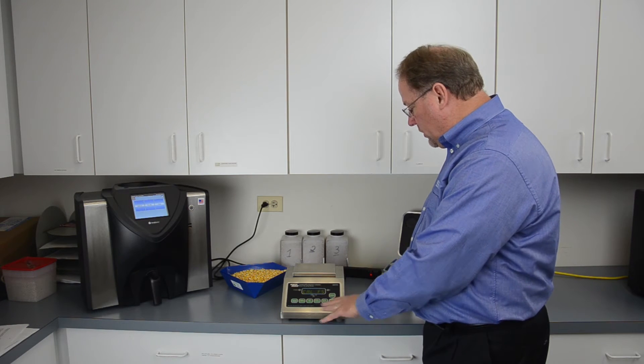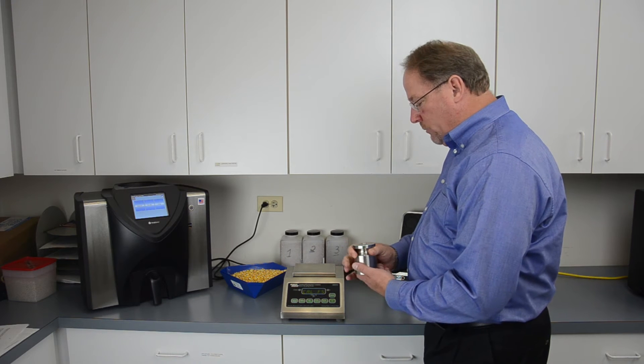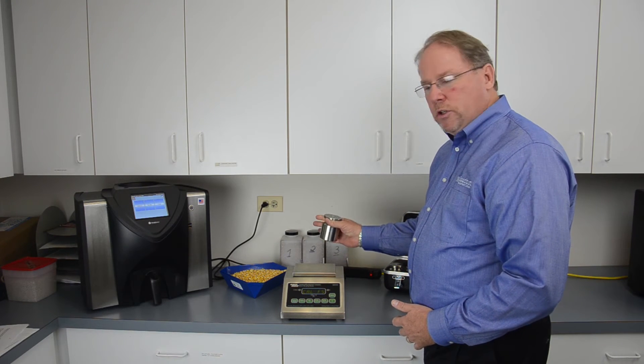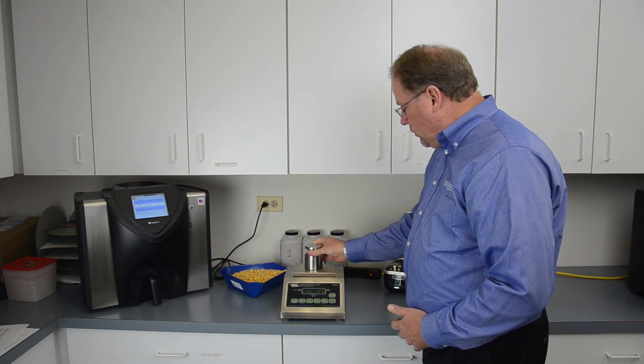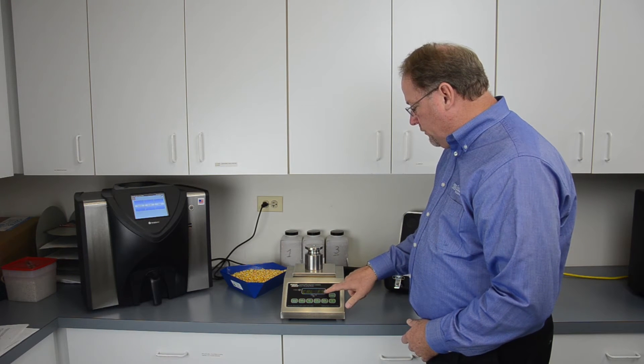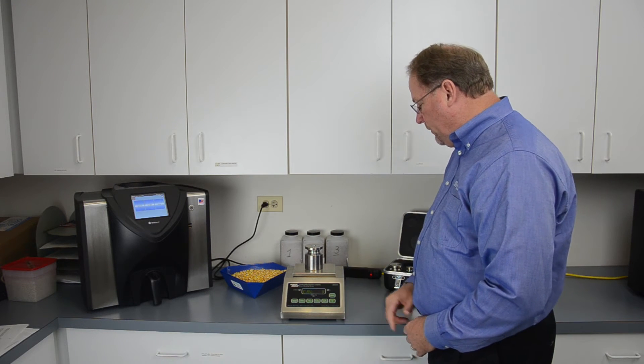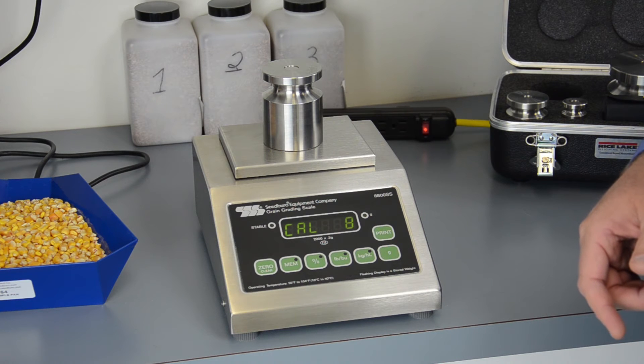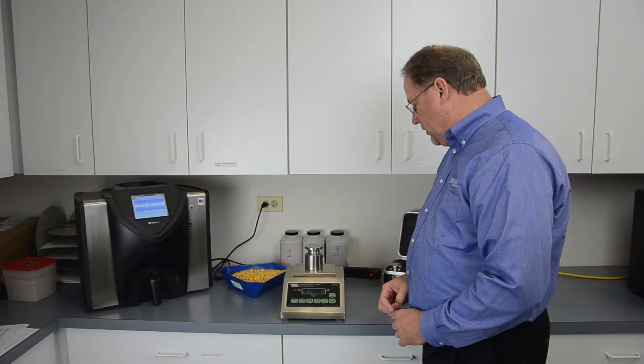The full scale calibration on this instrument is 2,000 grams. You'll want to use a precision weight of 2,000 grams at full scale. Push zero again. It once again counts down from eight to zero twice to record that weight into its calibration sequence.